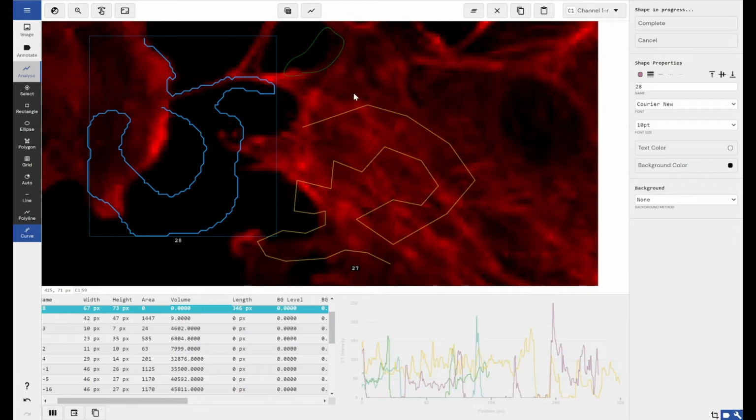So that's the Phoretix Toolbox. It's a completely open piece of software, allows you to get basic measurements without any kind of automation or any kind of guidance from the software.